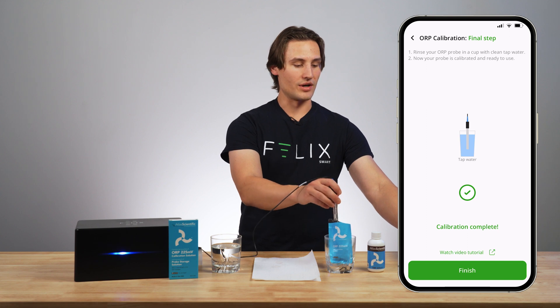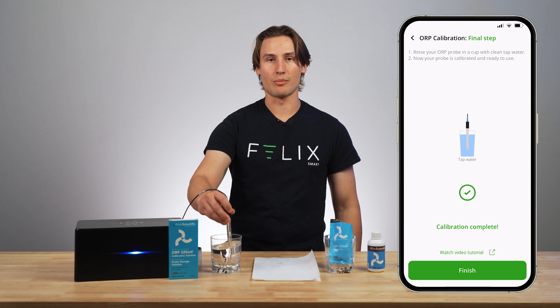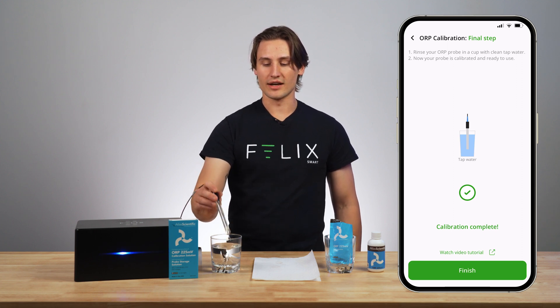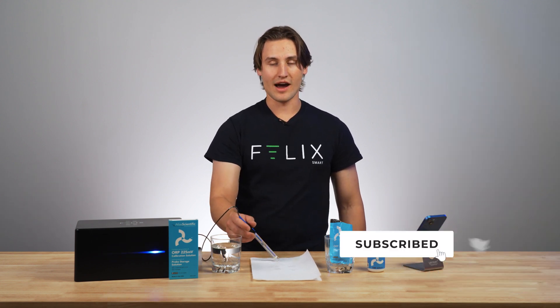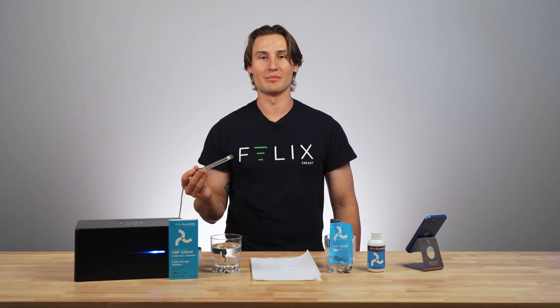Now I want to take this out of the bag and rinse my ORP probe in this clean tap water to get off all that calibration solution. I'll do that and then gently tap it again on this piece of paper towel to get off any excess water. And now my ORP probe is calibrated and ready to use, so I can stick it right in my aquarium.